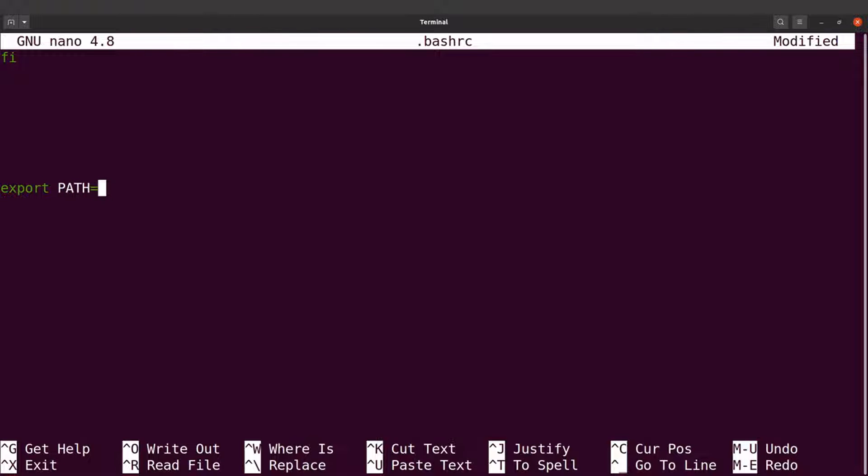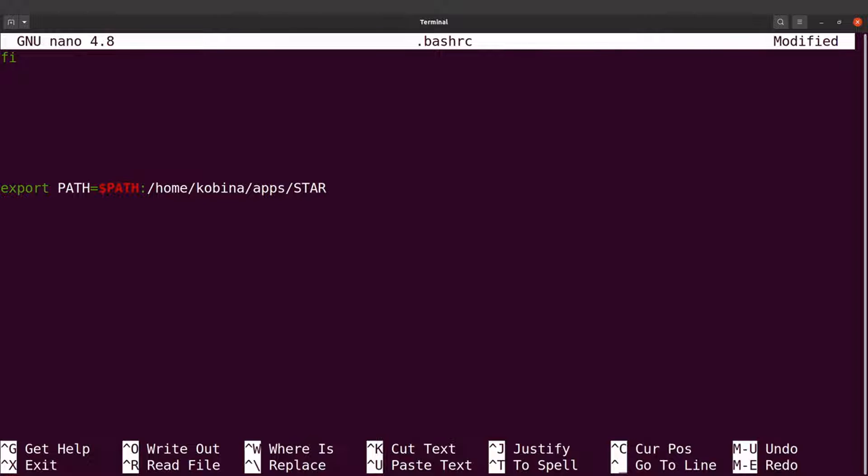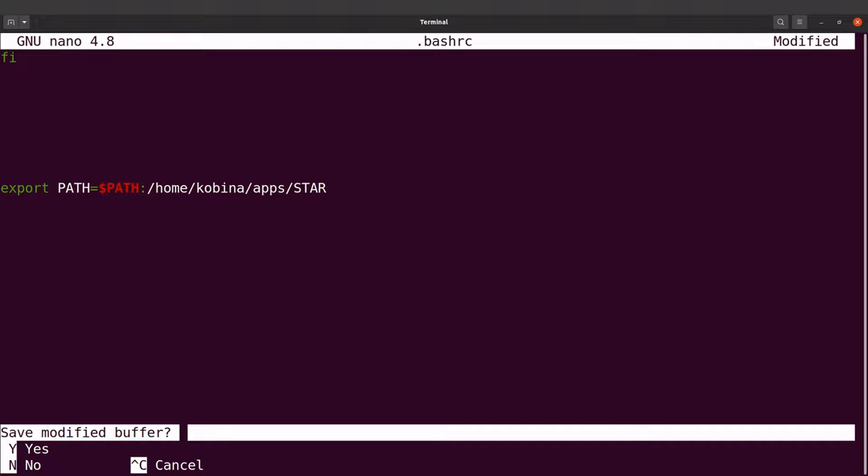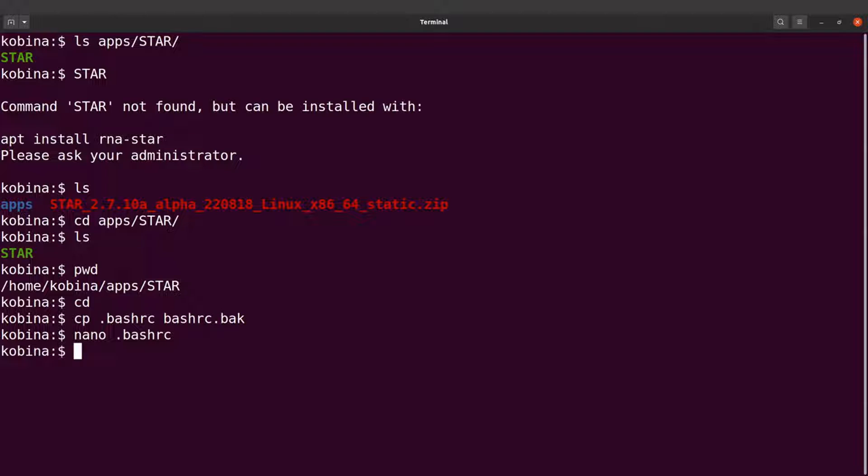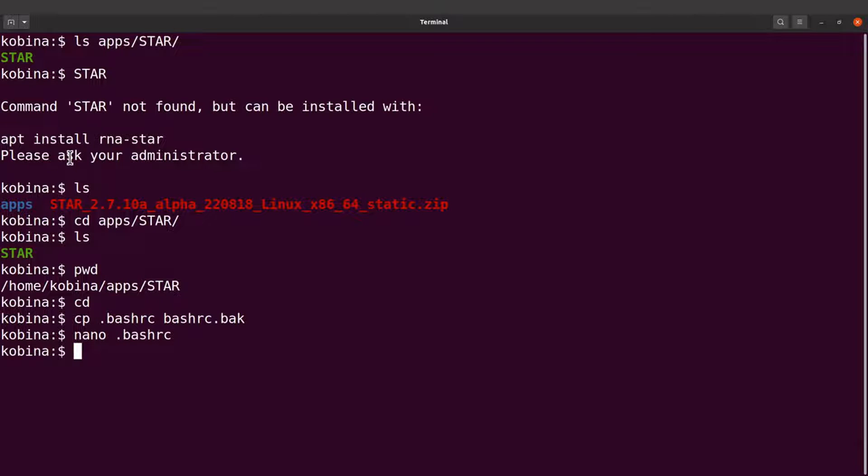And then I'll issue this command. I'll say export PATH equals dollar PATH. I'll bring a colon and then I'll also paste the absolute path to the STAR executable, and then I'll save the changes. What I'm going to do next is to open a new terminal so that the changes that I have made will take effect.